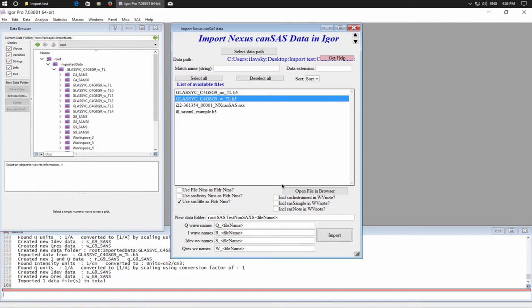Let's see if that one works, and that one may be the most useful one, because what you see is now, so the SAS title is now the proper name, and this depends on where your data come from. What did the instrument or the software which wrote the data do? How did they correctly name this? And this is basically a testing you cannot do.